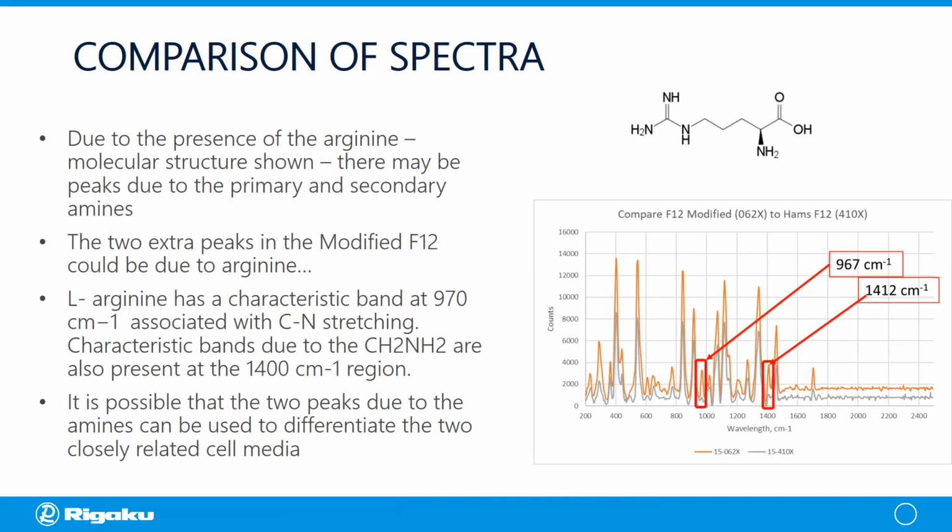That may not be a perfect solution, but because of the close correlation, a cascade model might be the best choice for this one. It can certainly be written into an SOP that any QA/QC lab can use. Remember, we were not looking at pure screening here, but rather we're in an analytical laboratory looking for a quick check of our materials.